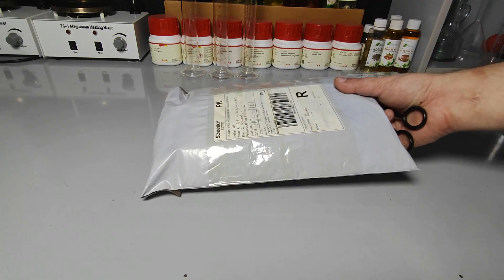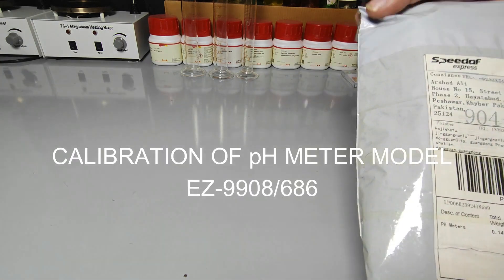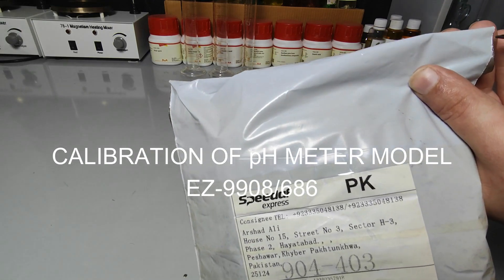Hello and welcome to the lab. Today I will show you how to calibrate the pH meter model EZ 9908-686.